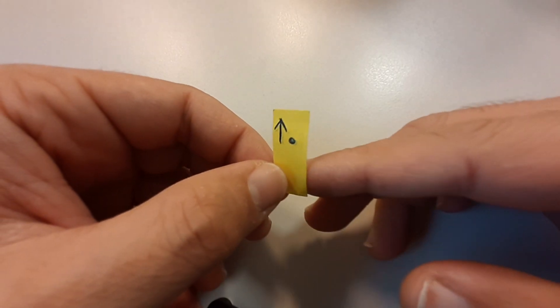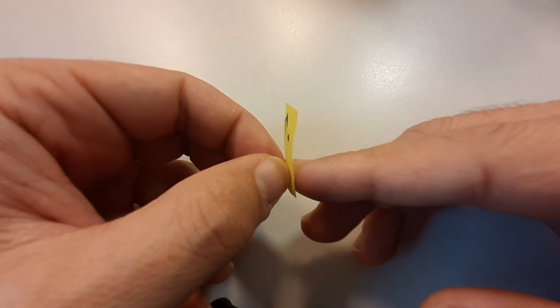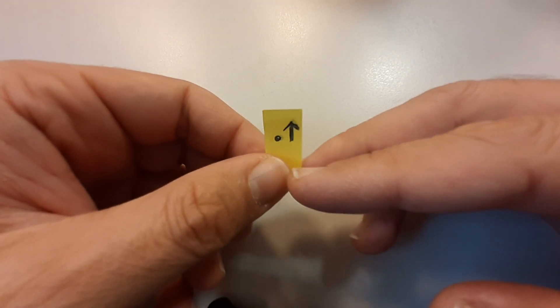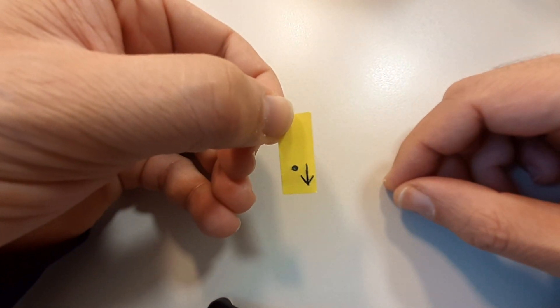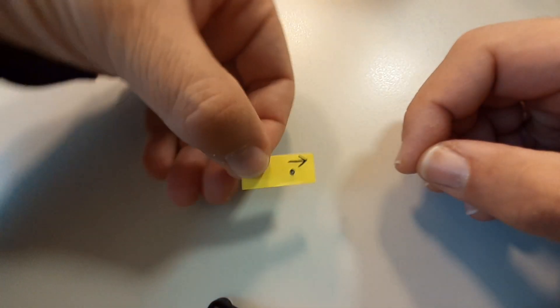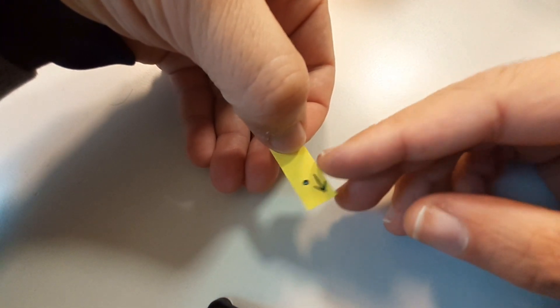I'm now using this paper to illustrate this. So the first prism flips the image from the left to the right. And then the second one flips the image upside down. And by doing these two flips, it's the same as simply rotating the image 180 degrees.